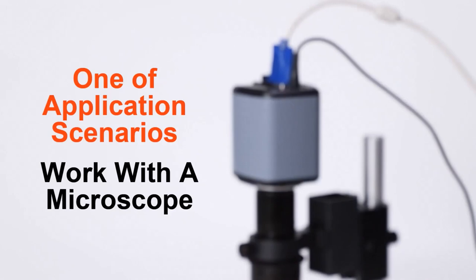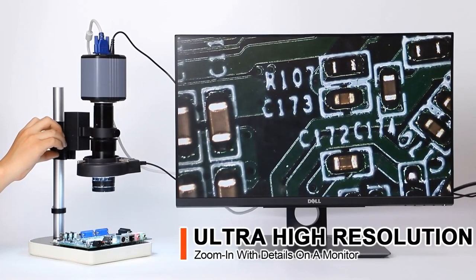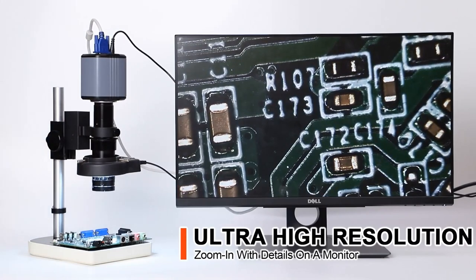Here is one of the applications of G2 working with a microscope. Ultra high resolution lenses enable zooming in with details on a monitor.